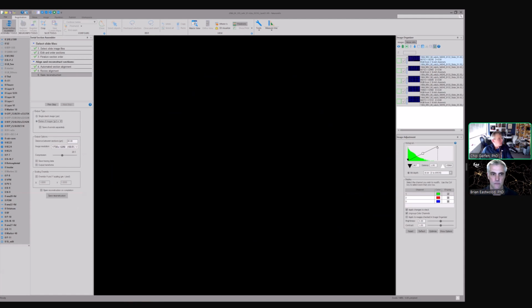Some people want to bring this into other programs, Python, various programs like that, and this enables taking those sections that have been aligned into other programs. There are various things that can be done. What we typically do is to generate a single stack and then hit save reconstruction. Not going to do that now because the case that I started off showing in this webinar was what was produced by this process.